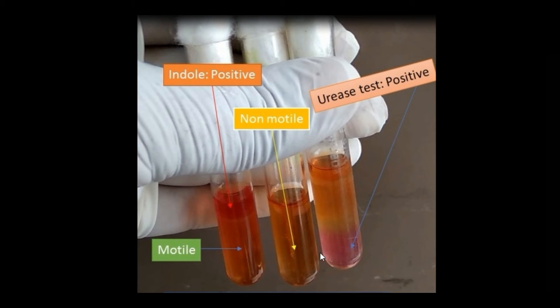Whereas lacking this color, here you can see in this medium lacking this color, in this tube the organism is urease positive, whereas in these two tubes lacking pink coloration, therefore urease test negative.